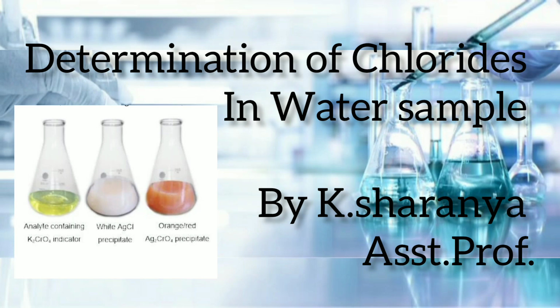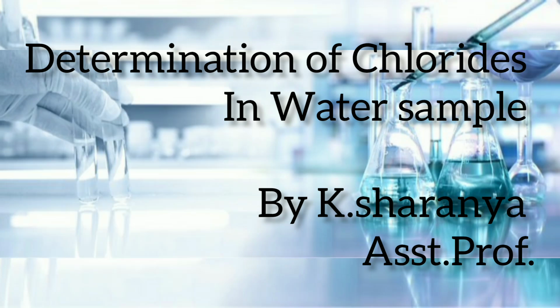Today I am discussing how to find out the chlorides in a water sample in the laboratory. Let us see what chlorides are and where we can find them. Chlorides in water can come from various sources, including natural sources, human activities and contamination.